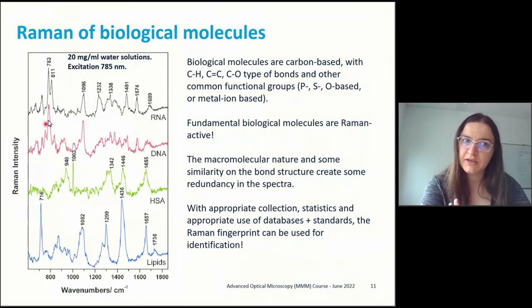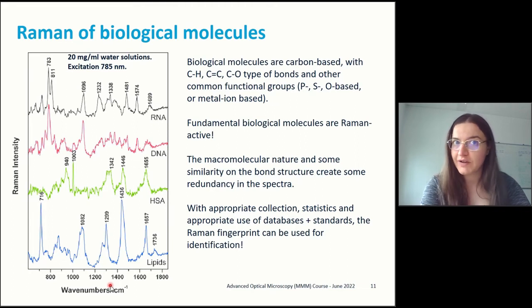Here you have this sequence of the triple peak, but the triple peak as it is here, with this distance between these two peaks, is completely different from this double peak that you see of the RNA. And on the other hand, other stuff like lipids will be distinguishable because they have peaks at different intensity. The shift in wave number does not overlap. So it can really be a quick tool to just tell you where we are and what I am seeing, if you do it properly.